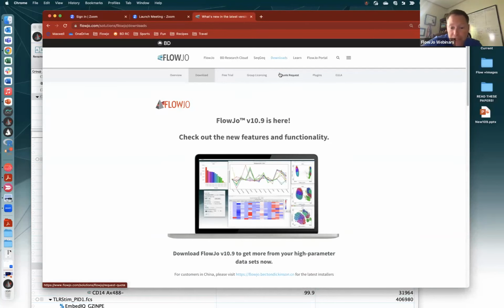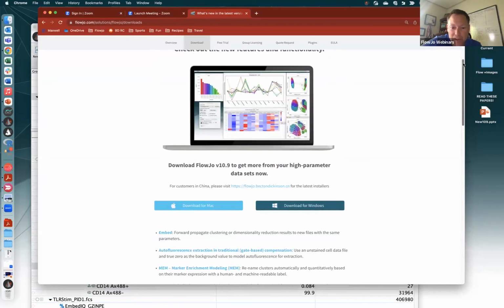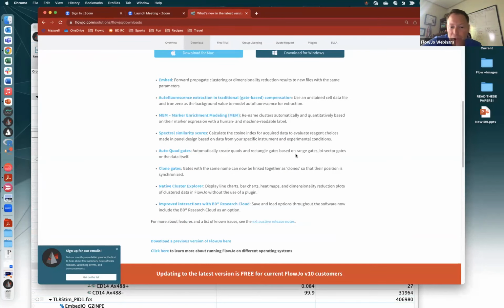Okay, 10.9's here. So I have a movie somewhere on it that I think will look a lot like this webinar looked. And there's some explanation of what all the tools were. Oh, I should mention too, I didn't want to take on too much in the webinar, but there are also just some improved interactions with BD Research Cloud. There are a bunch of places throughout the program where you can open or save something, like import a Diva file, that we've just added BD Research Cloud as a choice.